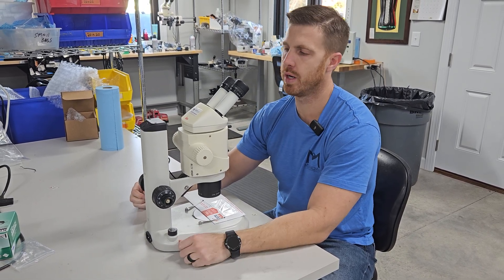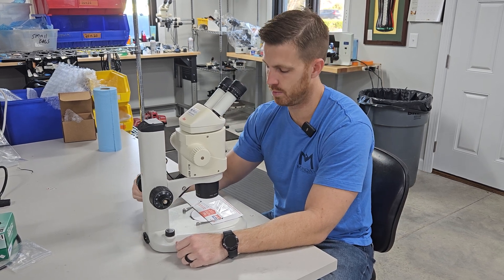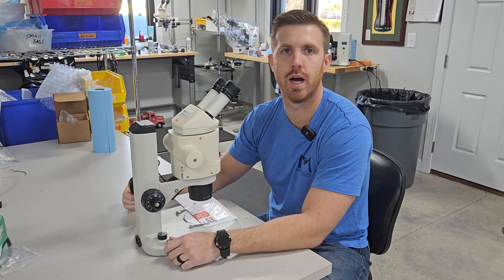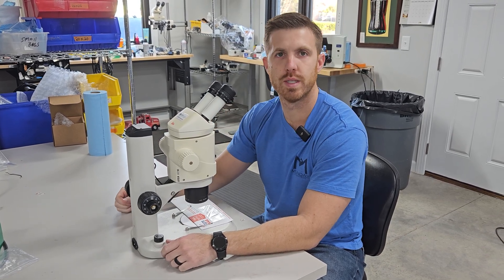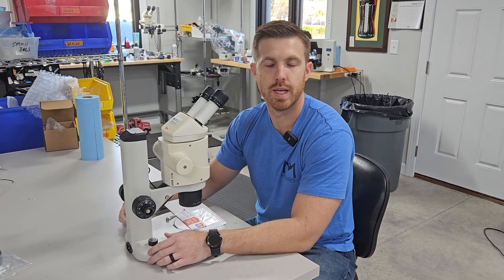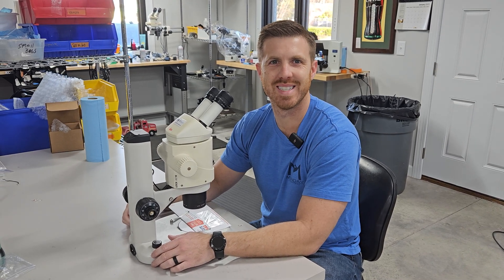If it doesn't hold focus, there could be an issue — it could be your eyepieces, the front lens you chose for your particular microscope, or a correction in your eye. This one is perfectly par focal and is getting ready to go out the door. If you're looking for used equipment or used microscopes, give us a call at Microscope Marketplace: 919-775-5596. Thanks.